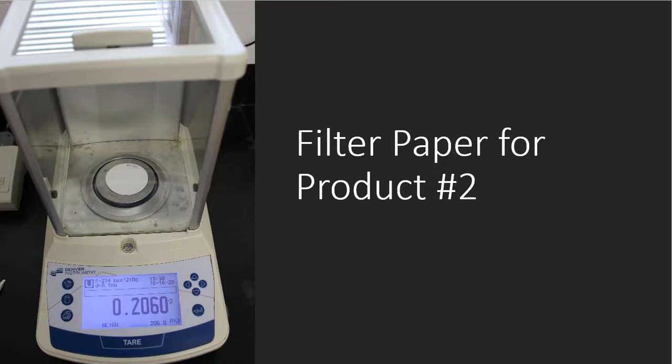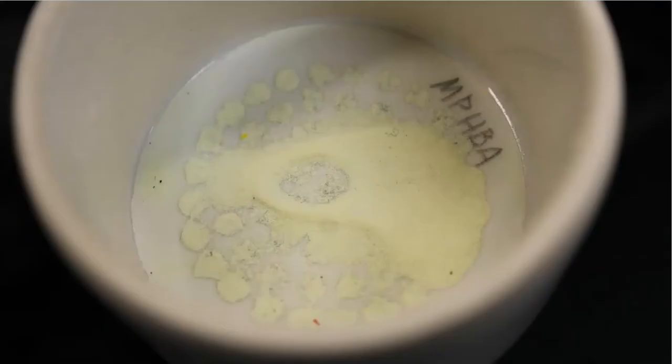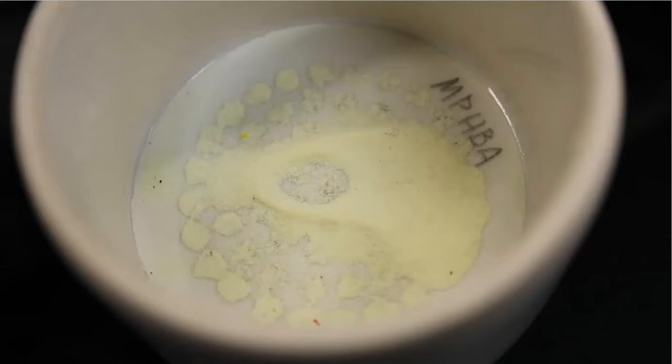So I take my filter paper that weighs 0.2060. There's my filtrate from that. And that is what my solid looks like. Oh, that's so sad and pitiful. I mean, you compare it to this one, which is the first one, it looks like a substantial amount. And then this one, oh God, I barely had enough to actually go over the holes of the Buchner funnel.